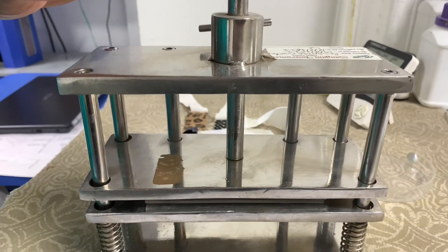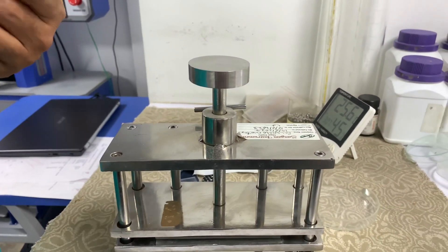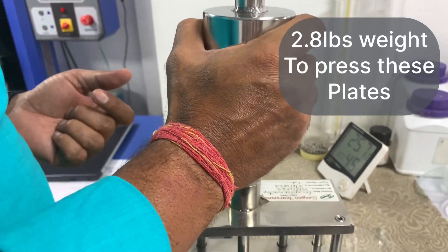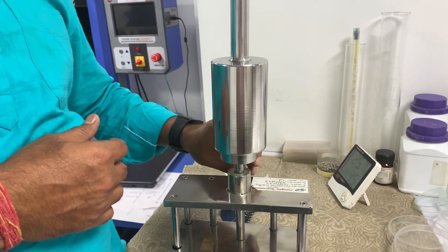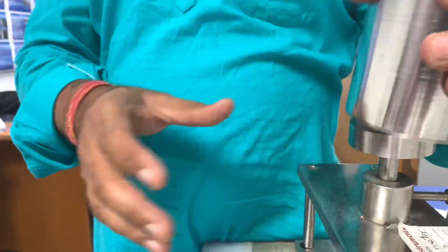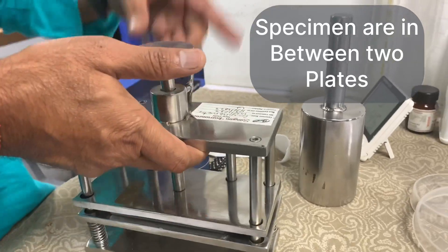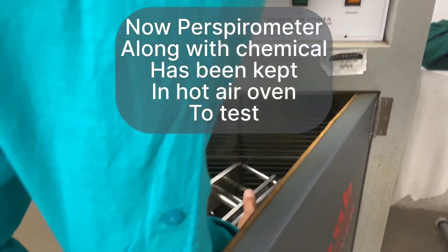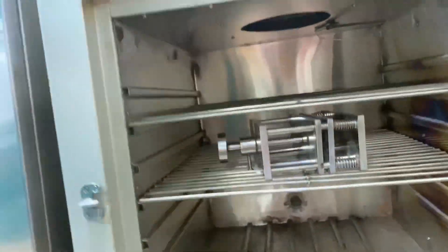Now you can see both plates are attached together. We need to add weight — the weight is 2.8 lbs — and place it inside the hot air oven along with the specimen to test.